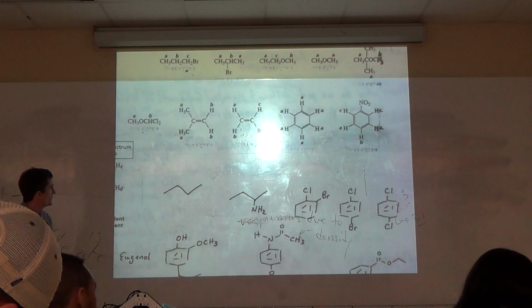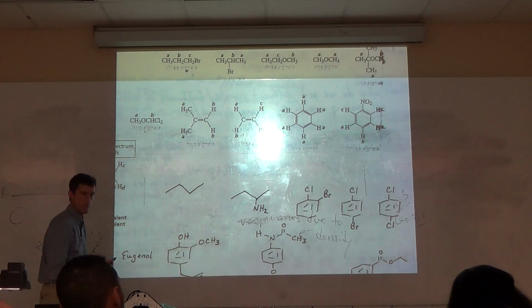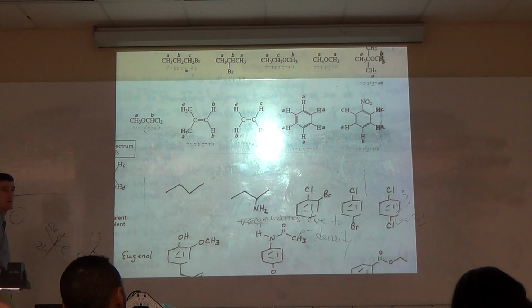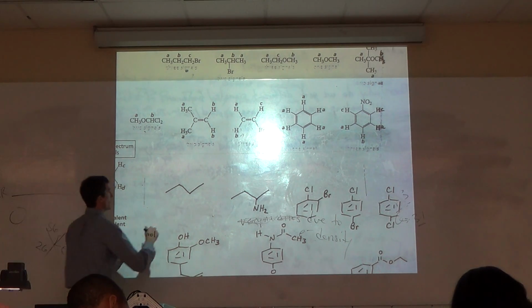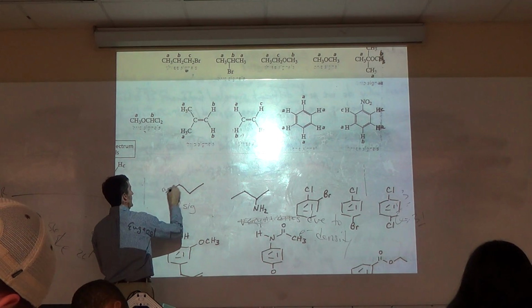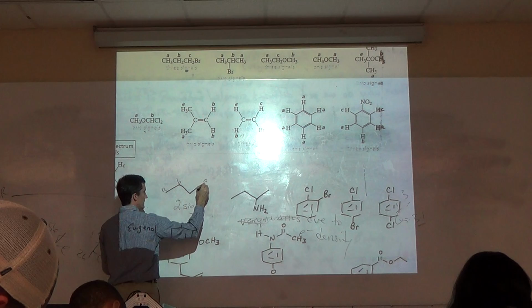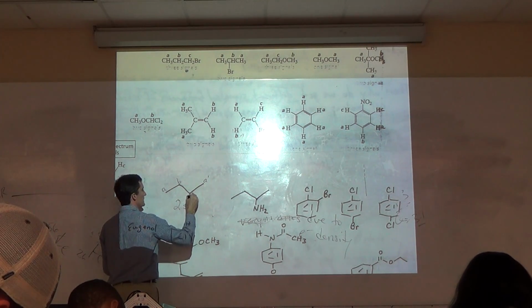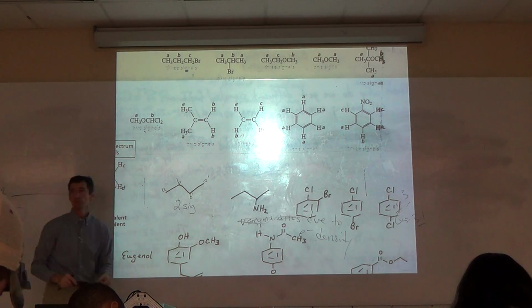Let's do some on our own. How about butane? How many signals? 2. Somebody? 2. A, B. What is this over here? That's also A. I'm going to call it A prime, and this is B prime. These two methyls are the same. These two CH2s are the same.